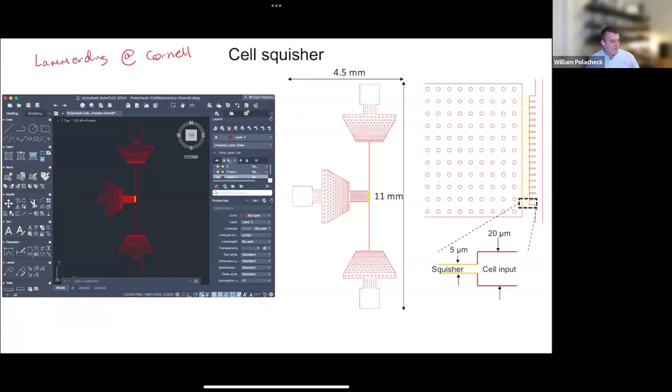You can use various other microfluidic-specific software, but I guess I'm old, so I like AutoCAD, which I think is coming out of favor these days because it's expensive unless you're in academia, but it's pretty easy to use. So this shows a line drawing of the masks that we're making to fabricate these microfluidic devices.